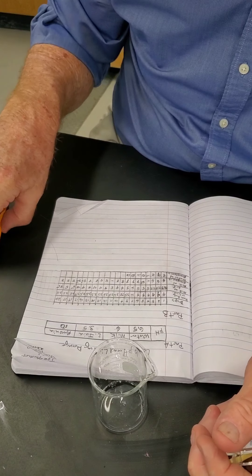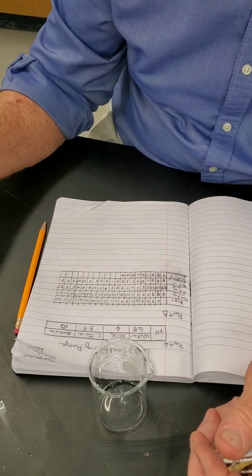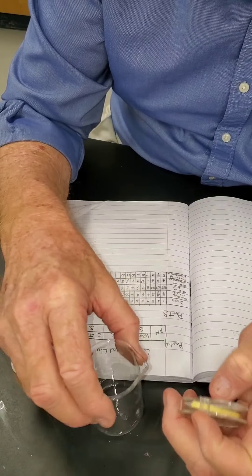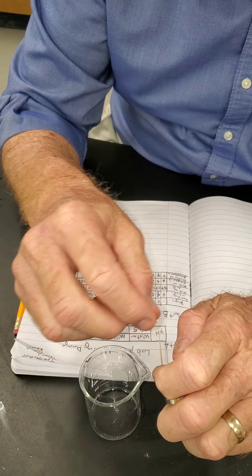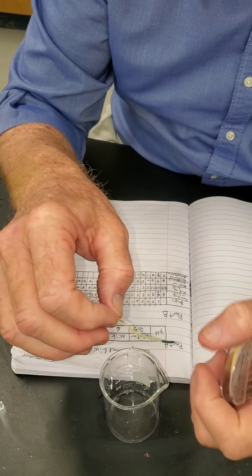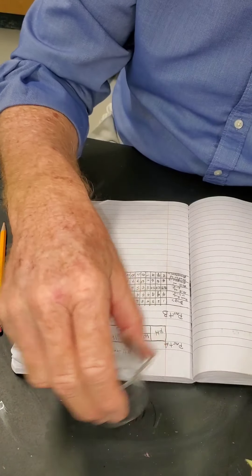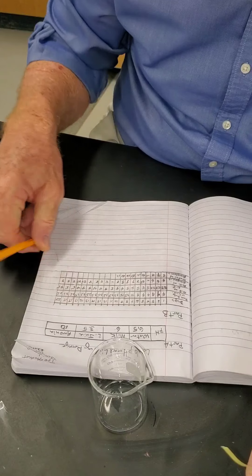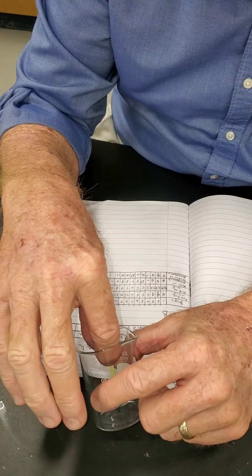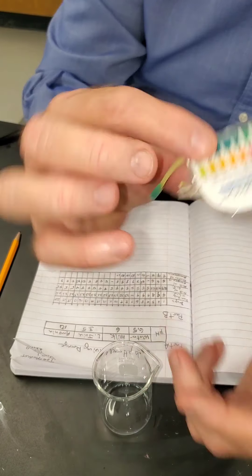If you don't swirl it around long enough, you might drop the pH paper right where you dropped in the ammonia, and that would give you a false reading because it's more concentrated right there. So swirl thoroughly, then pull it out and check. Drop 11 — it's 10 again.